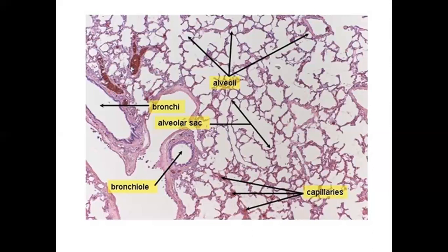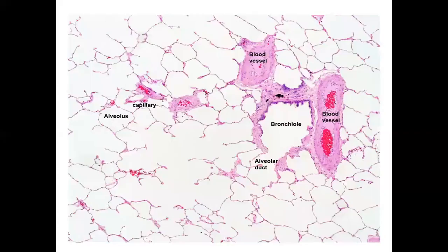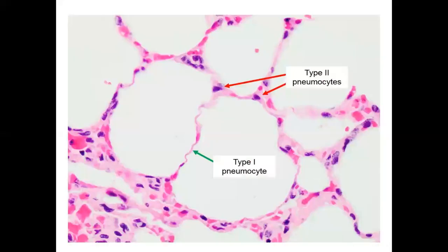The cells that line the alveolar ducts، عندنا two types of cells that line the alveolus. شوف هاي عندنا هنا bronchial، بعدها يجي عندنا الداكت، بعدها شوفوا ننتهي هذا 3 or 4 alveolus، وهذا هو نسميه السك. هذا هنا عندنا السك. تمام زين. عندنا two types of cells that are located at the alveoli، هي ال type 1 pneumocyte و type 2 pneumocyte.